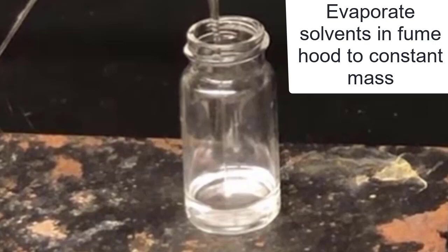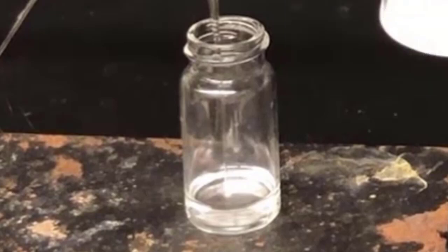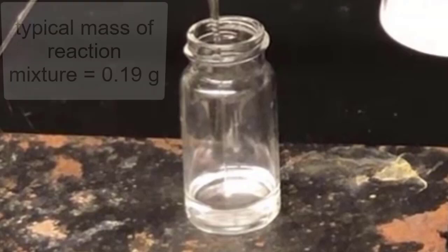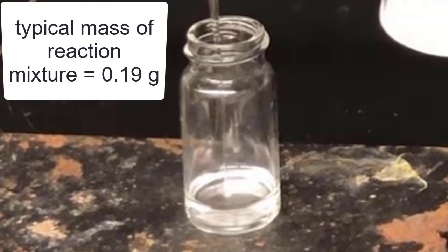The products in today's experiment, the alcohols, are very high boiling and there's no risk that they're going to evaporate. What we're getting rid of here is the ether and the tetrahydrofuran. A typical mass for reaction mixture in this experiment is 0.19 grams.